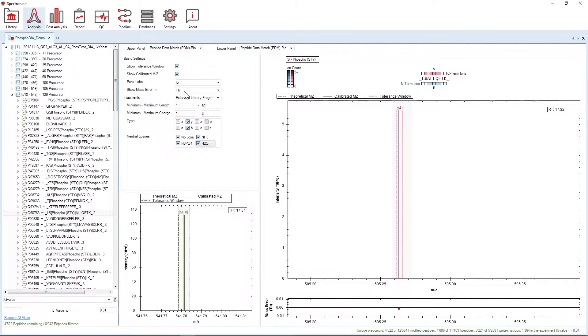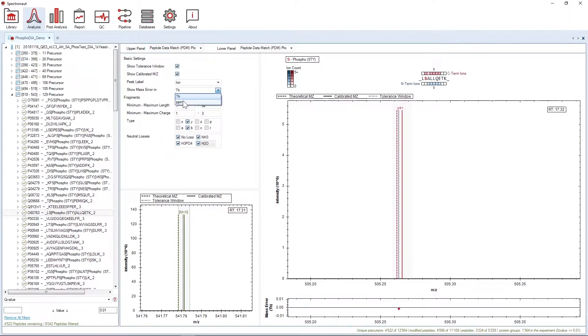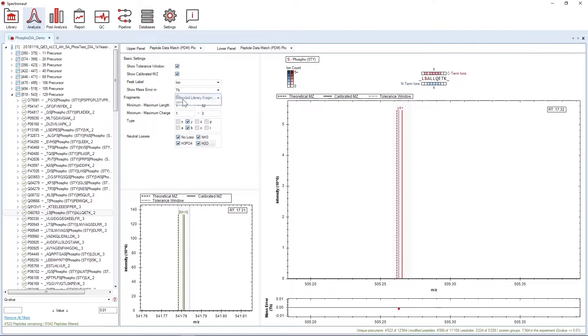You can also decide whether you want to display the mass error in Thomson or PPM in the bottom-right mass error panel.